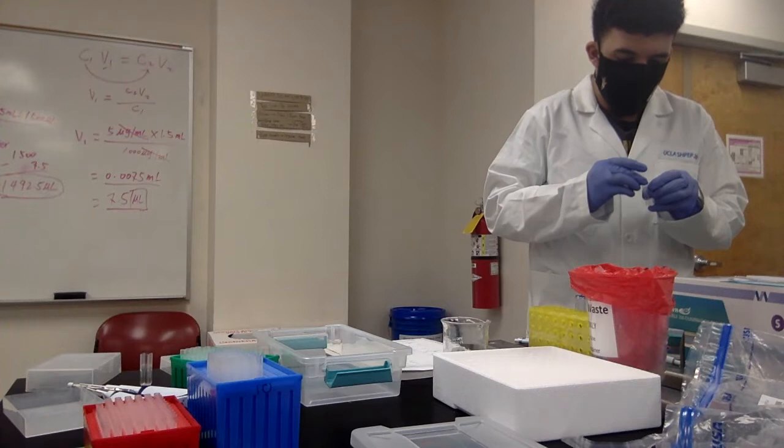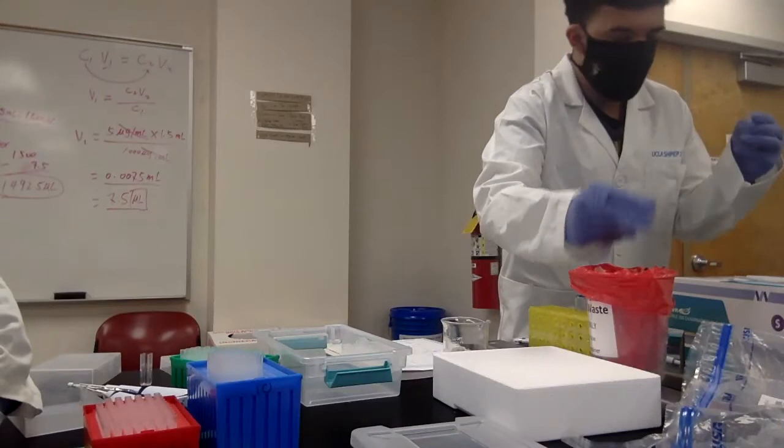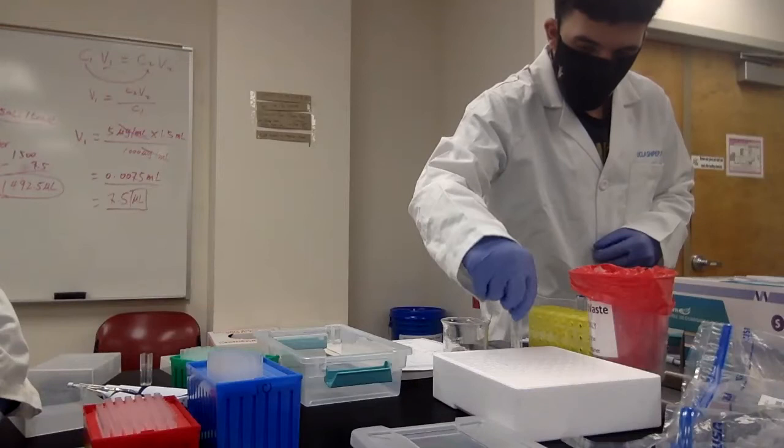So now we have three cuvettes available right now. But is that enough for doing the measurement? The answer is actually no. We need one more cuvette, which is just water. So that will be your blank sample.